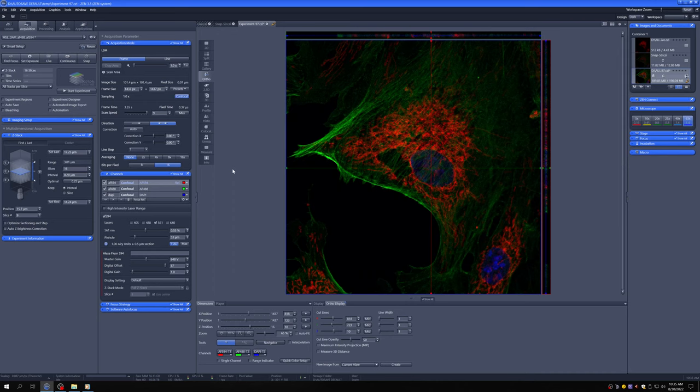That will improve the contrast of your images. So if you know you're taking a Z stack, you can use your knowledge of the fact that you're probably going to be doing deconvolution of the Z stack to not push for such a high quality image here because you can clean that up on the back end with the deconvolution. So that's one advantage of taking Z stacks is that you can then deconvolve them and you can push to have each image in the Z stack be slightly lower quality. Like, for example, the red here is a little bit noisy. That'll get cleaned up in the deconvolution.